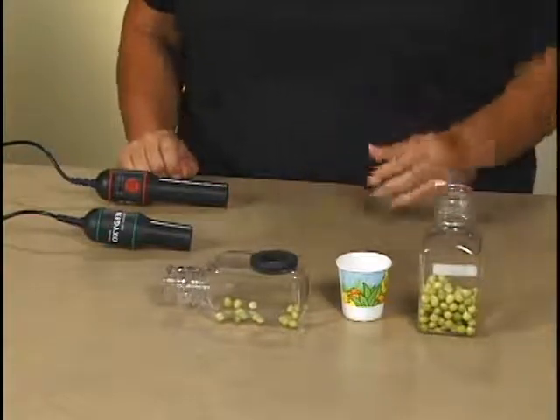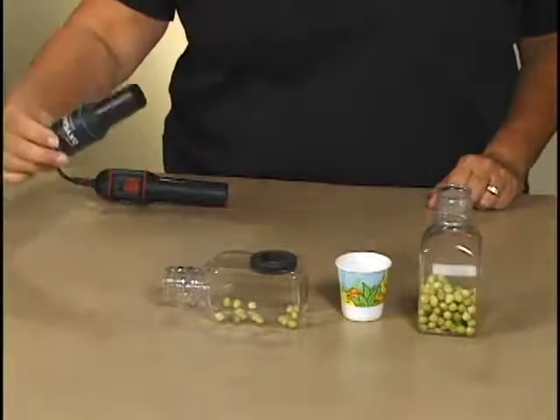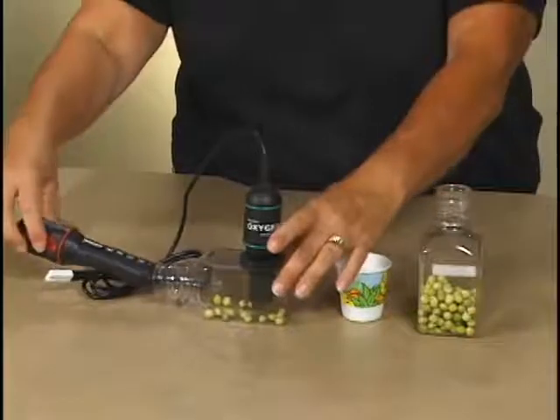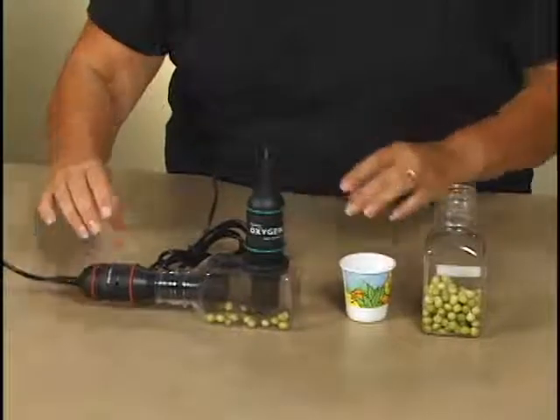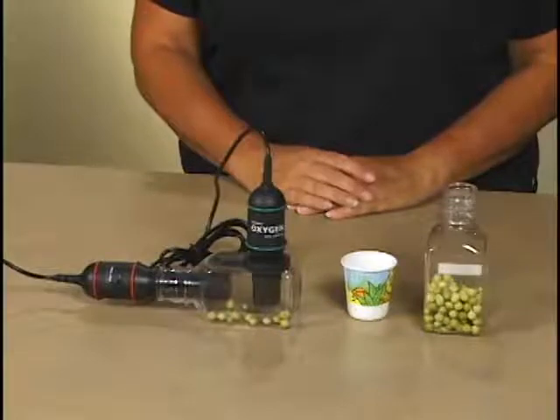Now, this is a biochamber 250 that allows you to use both the CO2 and the O2 sensors at the same time. I'm going to put the oxygen gas sensor into the top of the biochamber and the CO2 gas sensor into the neck of the biochamber. Carbon dioxide gas is heavy and will lay down towards the bottom of the vessel. This orientation will allow you to pick up the CO2 earlier.